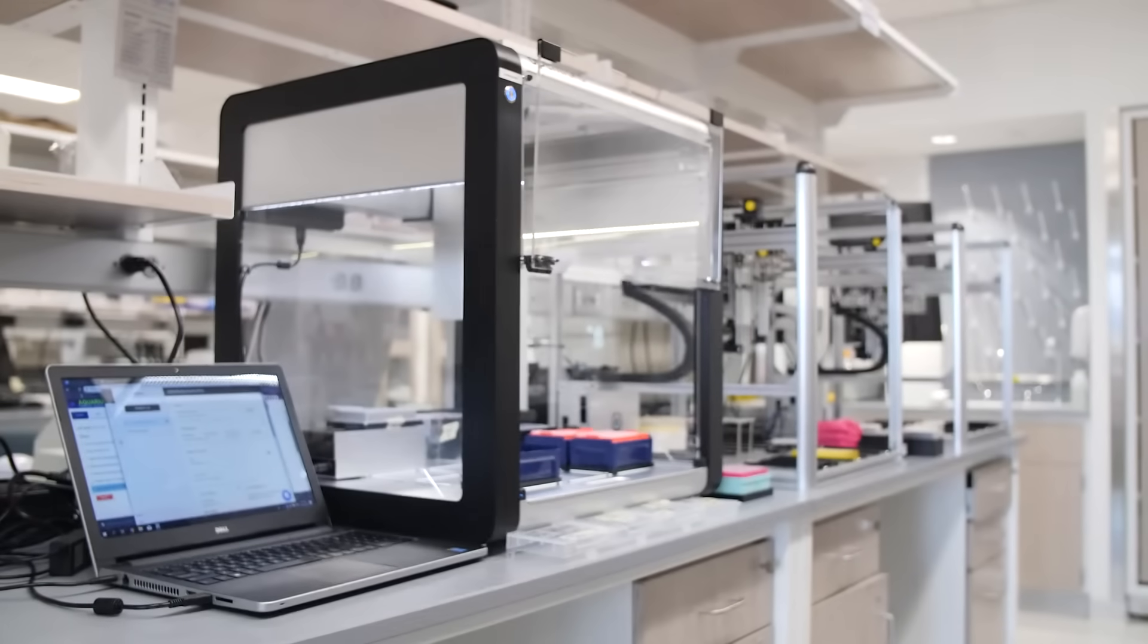Hi everybody, thanks for joining me today. I'm Nick Kreider from Opentrons and I'm here to talk a little bit about the OT2, our pipetting robot.